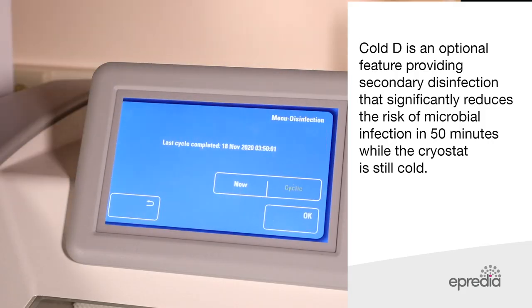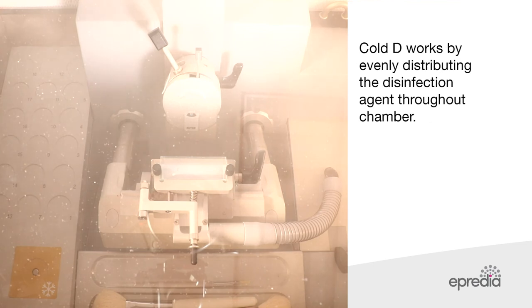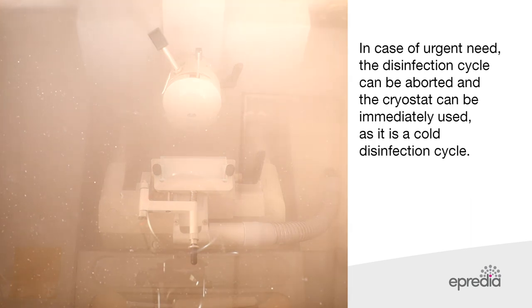Cold D is an optional feature providing secondary disinfection that significantly reduces the risk of microbial infection in 50 minutes while the cryostat is still cold. Cold D works by evenly distributing the disinfection agent throughout the chamber. In case of urgent need, the disinfection cycle can be aborted and the cryostat can be immediately used, as it is a cold disinfection cycle.